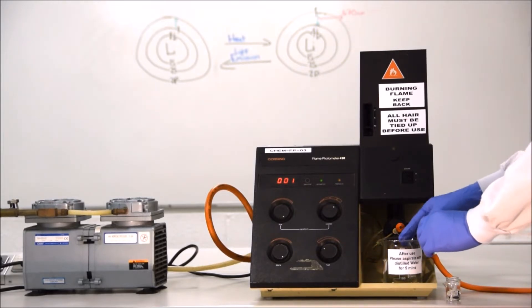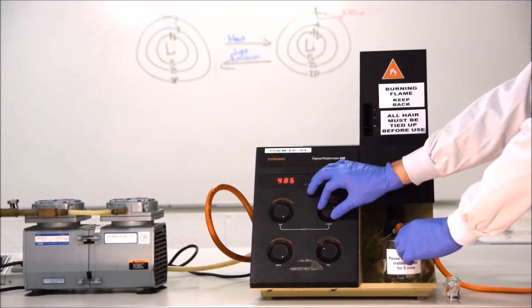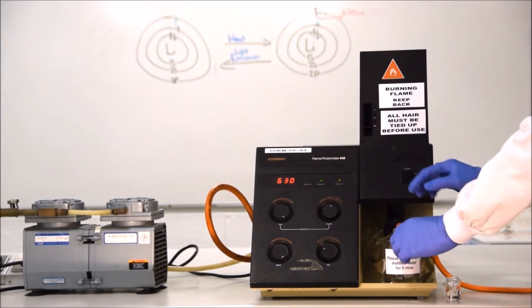Next, we're going to check the sensitivity is okay. In order to achieve this, we're going to take our most concentrated sample and see that it gives us a reading that is within a reasonable range. That is to say that it provides a three digit reading, but that the reading is not beyond the scale of what is measurable by the machine.